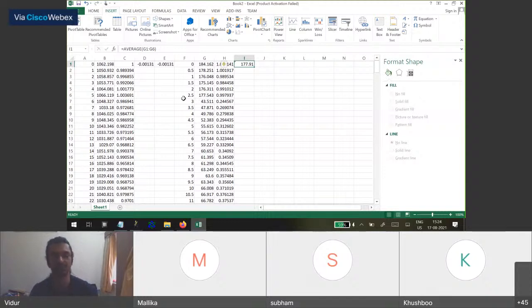So we have to reorient this time series so that the first post-bleach frame starts from 0. And this is simple enough to do, since we just have to put a simple equation, which is put equal to this time series minus 3, since 3 is the first frame.